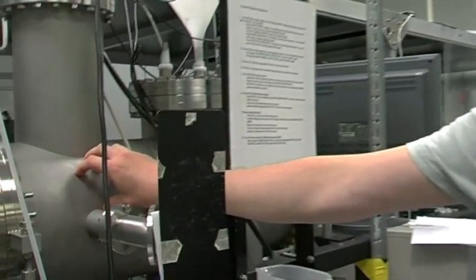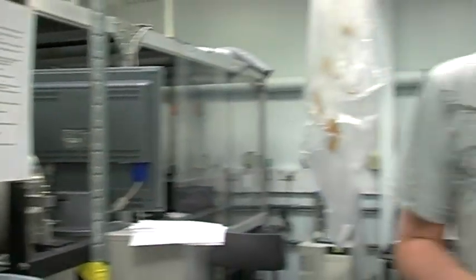Over here is where the laser actually crosses those molecules. We've got our molecule, our first laser pulse comes in and excites that molecule and starts the reaction happening, so the bonds are starting to break and rearrange. We then come in with our second laser pulse and take snapshots of that molecule as it's changing.